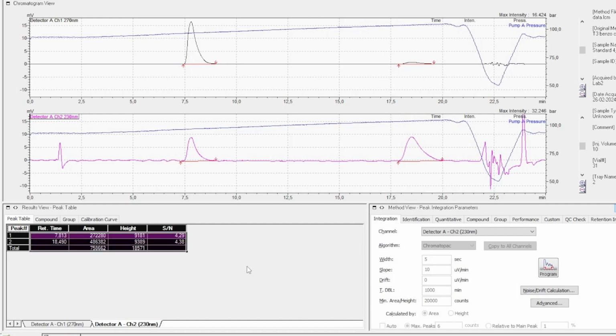Okay, let's try and see if we can optimize the data treatment a bit. If you don't want to go through every single file and open it up and copy out all of the different peaks, once we've developed a method to analyze our data, we can actually take all of the samples that have been run and export them into text files.